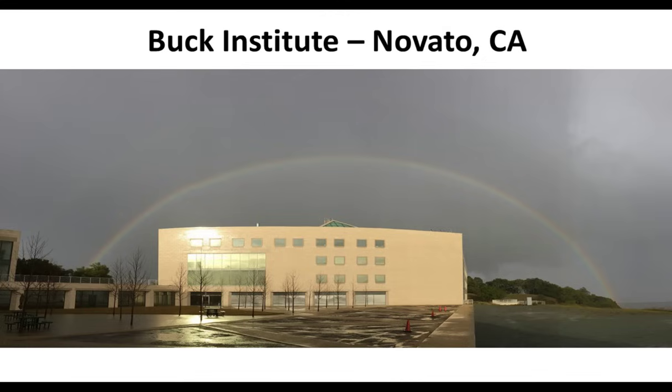Would this approach work for serum samples or other sample types? Yeah, we actually have a lot of different samples in our institute. We sometimes also get C. elegans samples or Drosophila. We have a broad spectrum. I have in the past worked with serum, or rather plasma, and we did a lot of glycosylation analysis. I do think that this particular one-pot PTM workflow and these antibodies should work fine in plasma. In fact, we are intending to do this with some longitudinal samples that we will get from plasma soon. So that should work just as fine.